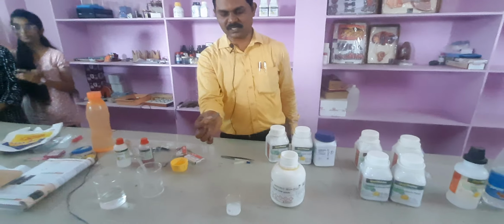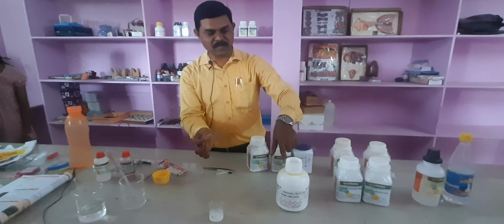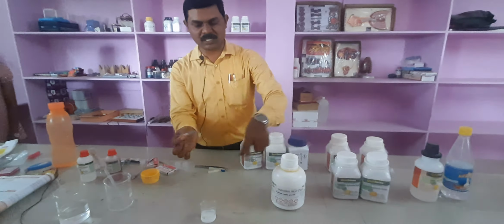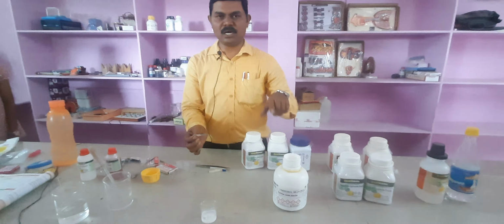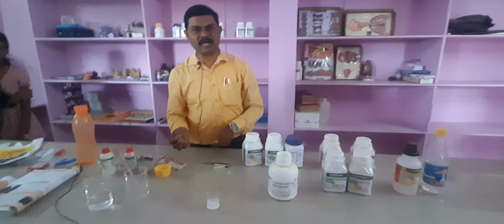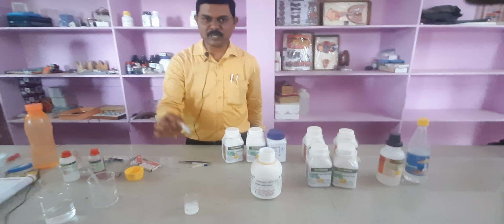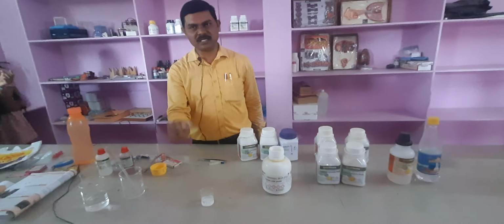Okay, so we got success. Our experiment is a success. We made calcium hydroxide from calcium oxide. Calcium oxide is a metallic oxide which is basic in nature. When metallic oxides dissolve in water, they produce bases. So the final conclusion of this activity: when calcium oxide dissolves in water, it produces calcium hydroxide. When you test with red litmus paper, it turns blue. So this is a basic substance.